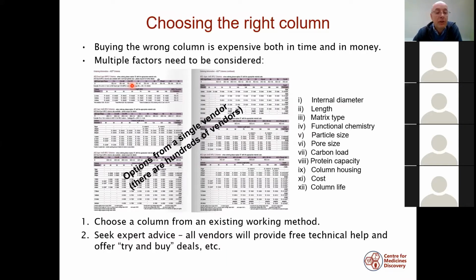If you're not able to do that, I would seek expert advice, unless you're an HPLC expert, in which case you don't need to listen to this talk. You can get this obviously from people who have experience of HPLC, but you can also approach the vendors and they will give you free technical help, and they will always help you choose the right column for your application.